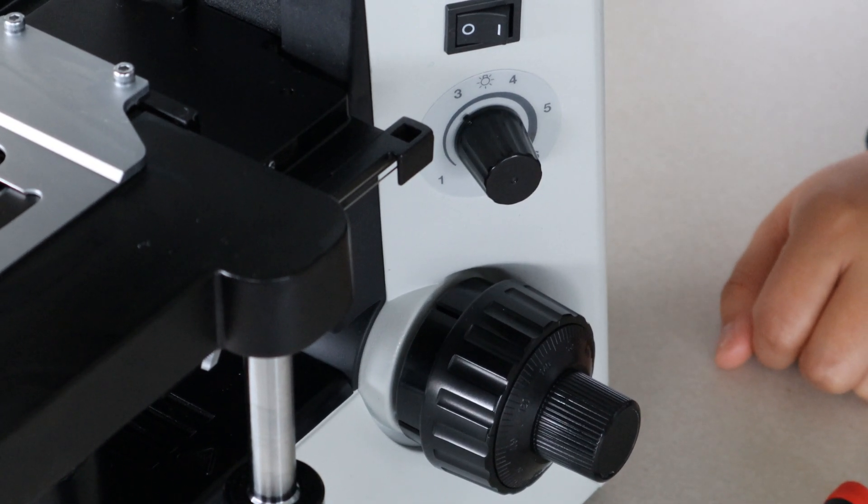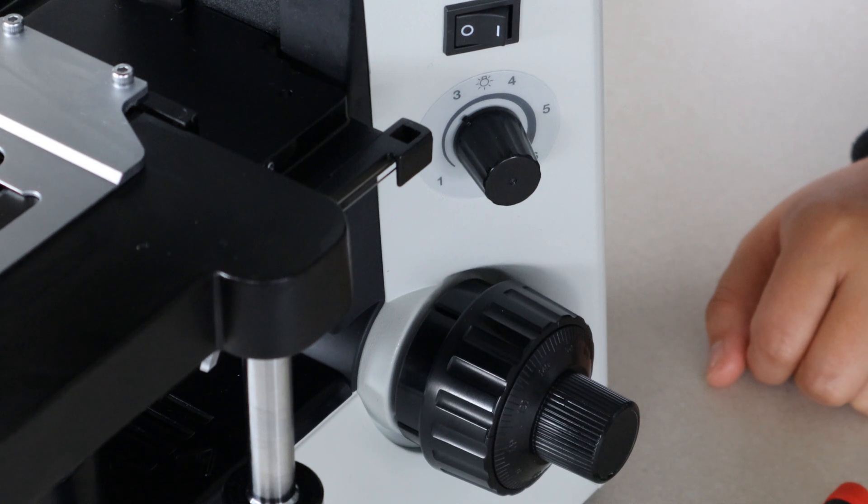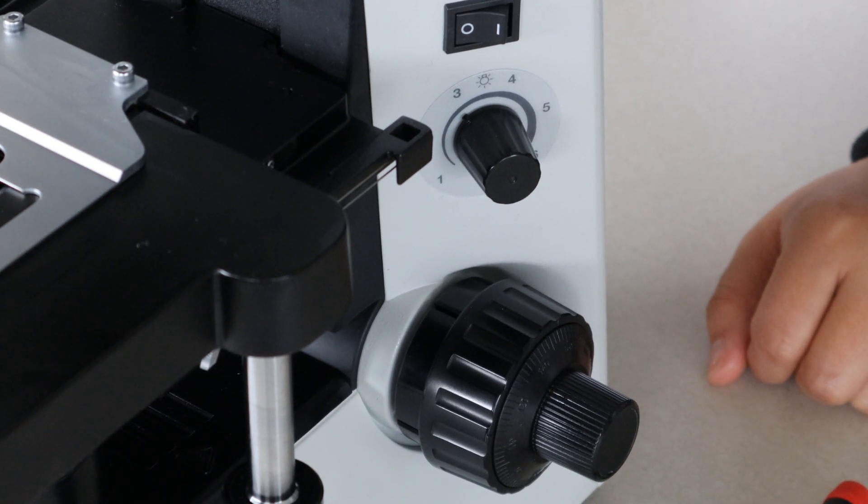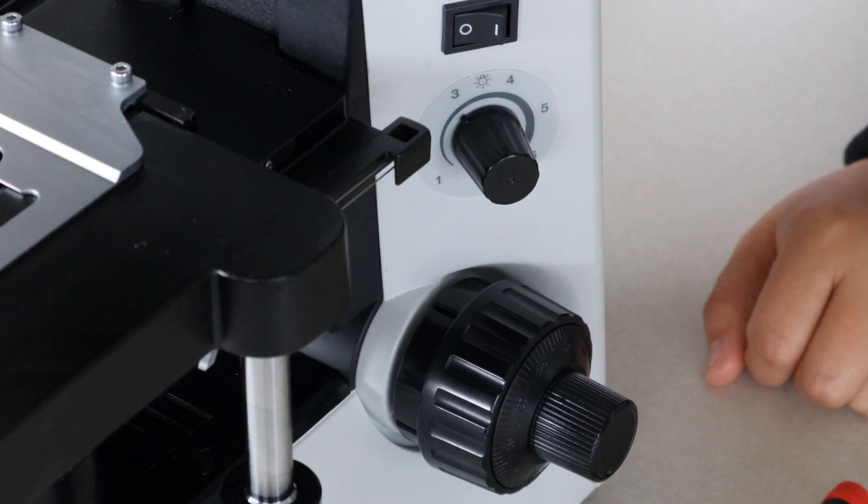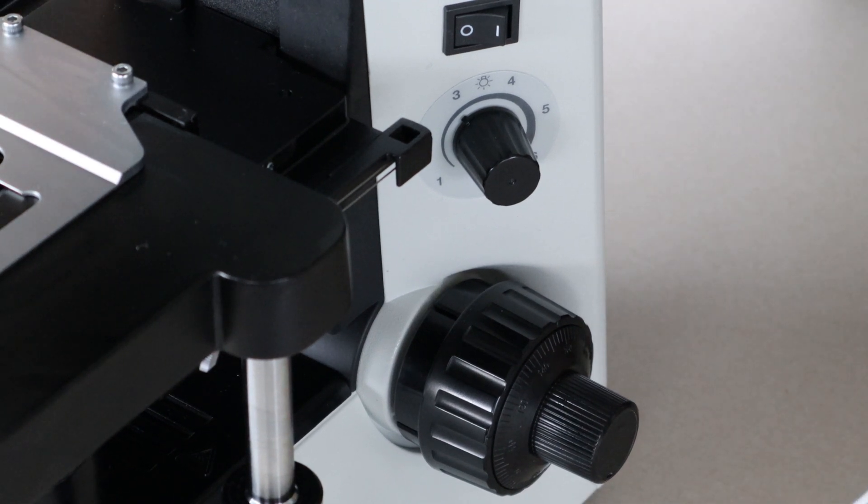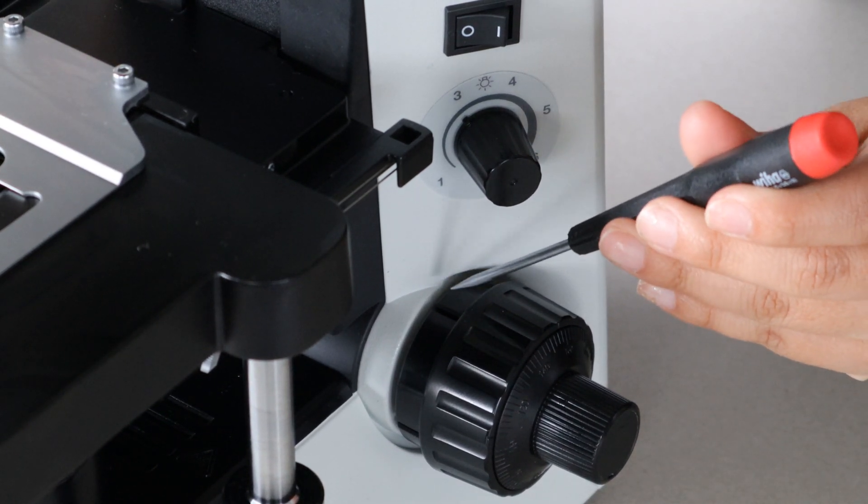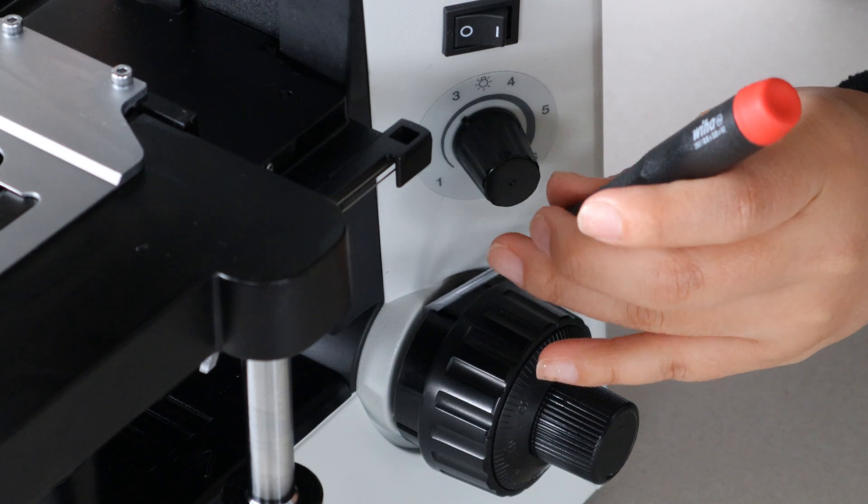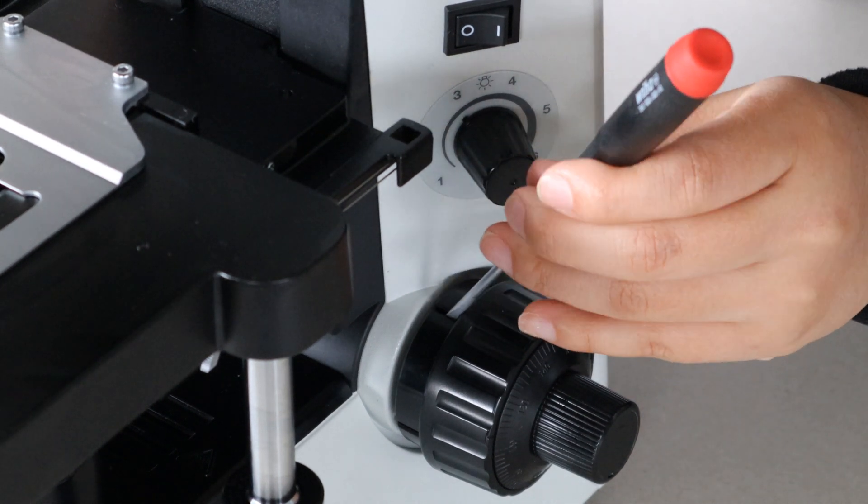So turning the tension adjustment clockwise will increase the tension, and turning it counterclockwise will decrease the tension. And like you saw, just about an eighth to a quarter turn should be enough to get it adjusted down. You'd want to do this if you felt your tension was too stiff on your microscope.